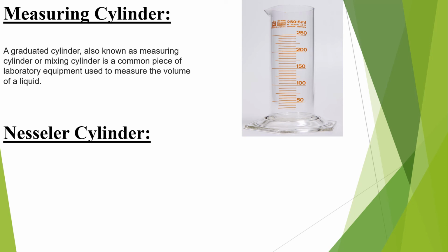A graduated cylinder, also known as measuring cylinder or mixing cylinder, is a common piece of laboratory equipment used to measure the volume of liquid.